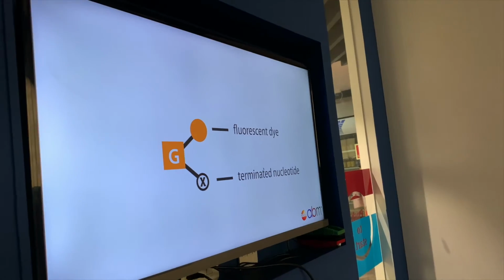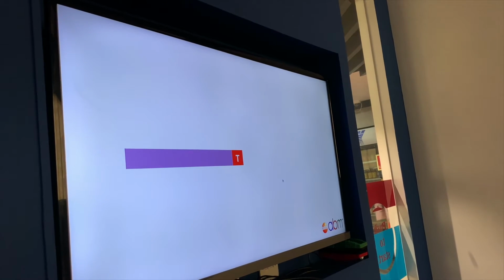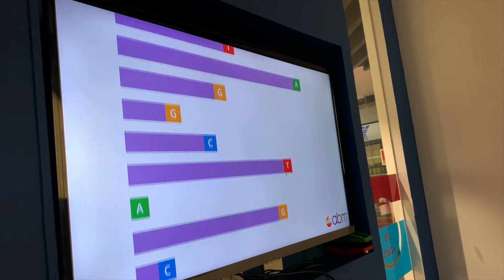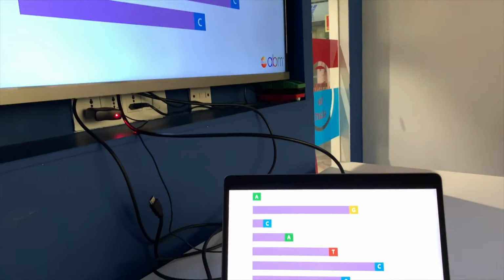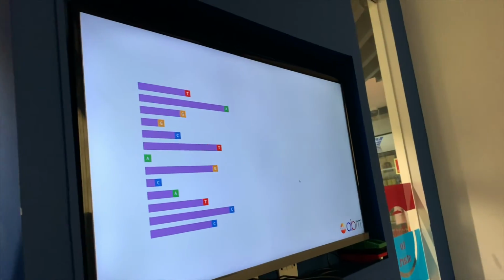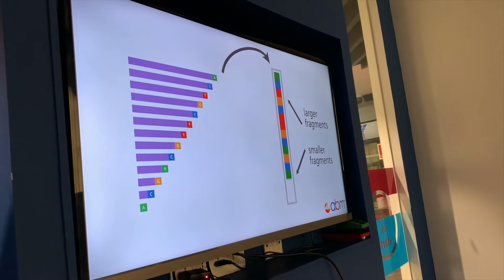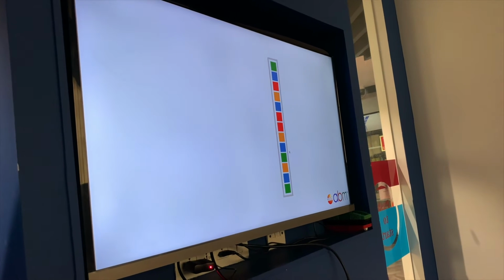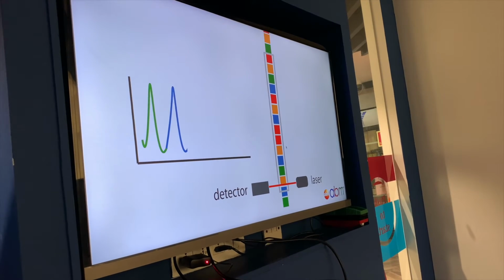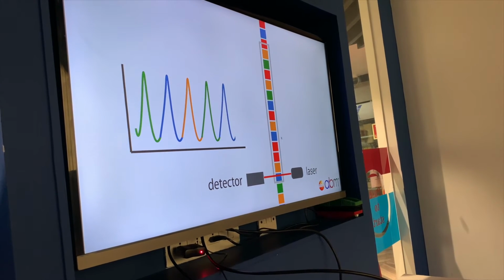Library quantification. Each nucleotide has a fluorescent dye attached to it, allowing for automatic detection of the DNA sequence. As a result, many copies of different length DNA fragments are generated in each reaction, terminated at all of the nucleotide positions of the template molecule by one of the dideoxynucleotides. The reaction mixtures are loaded on the sequencing machine, either manually onto slide gels or automatically with capillaries, and are electrophoresed to separate the DNA molecules by size. The DNA sequence is read through the fluorescent emission of the dideoxynucleotide as it flows through the gel. Modern-day Sanger sequencing instruments use capillary-based automated electrophoresis, which typically analyzes 8 to 96 sequencing reactions simultaneously.